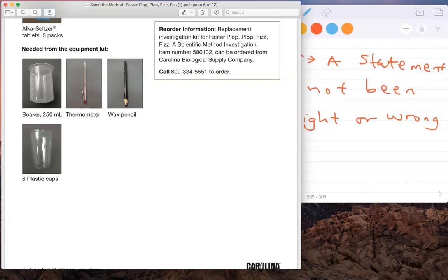There will be 3 temperatures. You'll collect the data. If you don't have ice, I know, at some point I used to live in an apartment and my refrigerator didn't have an ice maker. So if you don't have ice, I recommend that you do not start the experiment until you have ice, or you can do the first two, and then once you have the ice, you can collect the data. So you will need this.